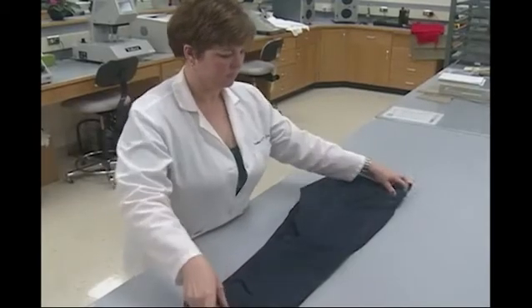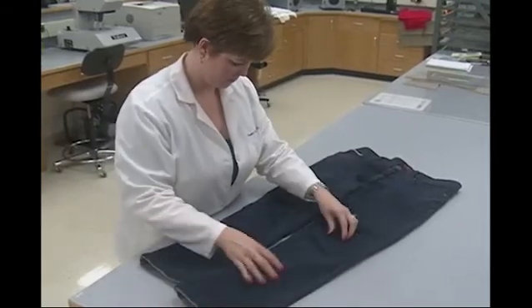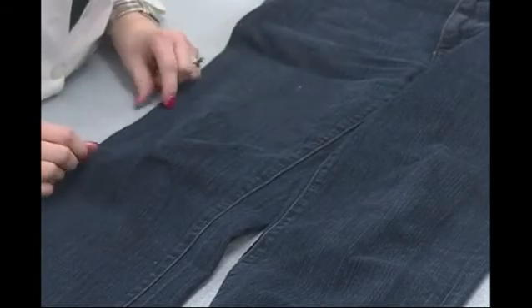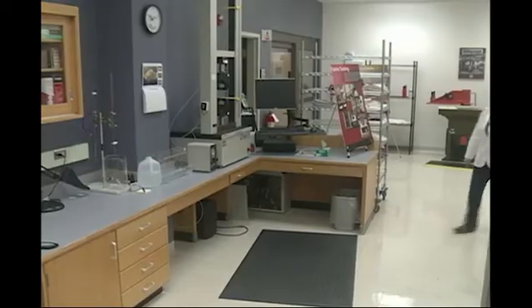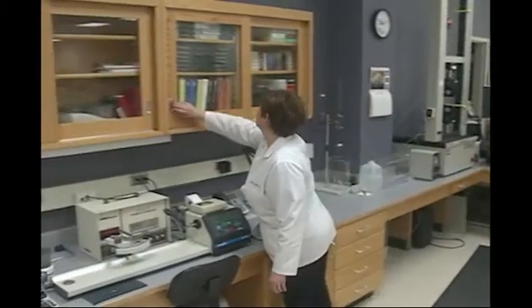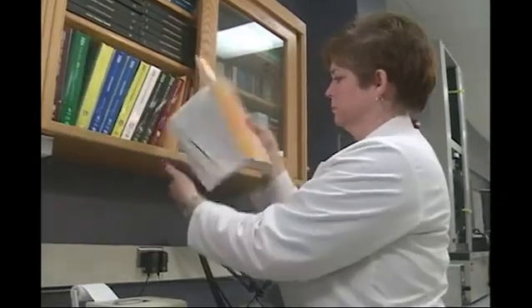The same phenomenon of bagging and sagging in garments at the same places can occur with garments made of woven fabric too. Therefore, the textile industry developed a standard test method for the measurement of stretch and growth of woven fabric in 1975. As with the standard test method ASTM D2594 for knitted fabric stretch and growth that utilizes benchmarks and the application of force, ASTM D3107, the test method for woven fabric stretch and growth properties, does likewise.